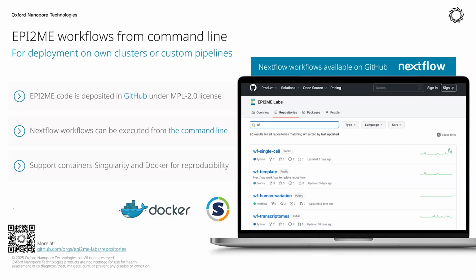So even though it's a template for EPI2ME, we're basically just kind of adding extra definitions to parameters, so that when you load your Nextflow workflow into the EPI2ME software, it understands what fields are looking for. So, are they looking for a file or a folder path, or is it looking for, like a text entry, or is it kind of just a drop-down menu is appropriate?